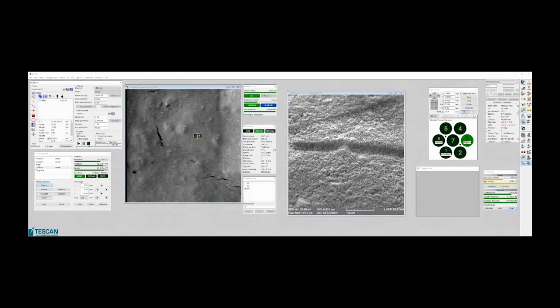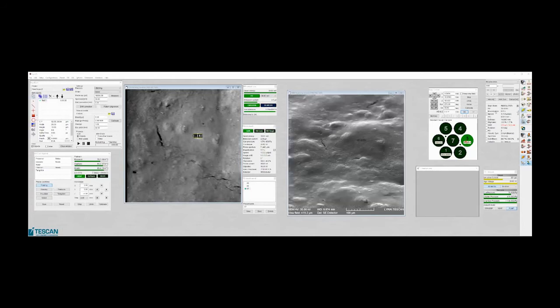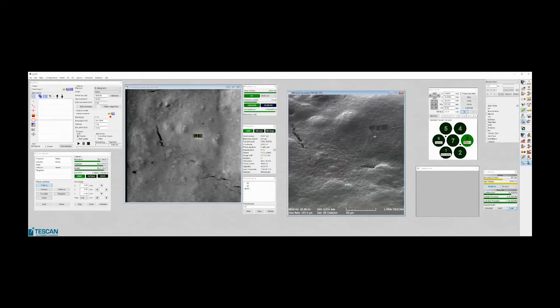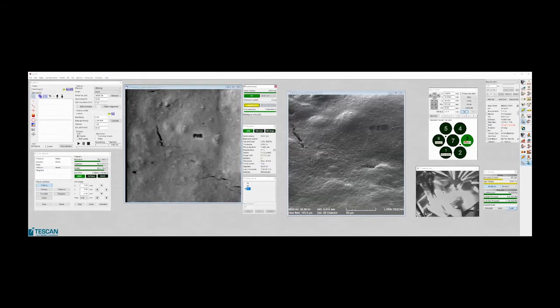Okay. Yeah, it's already there. Yep. See it in here. Okay, it's nothing very scientific, but you can create whatever you want, just as an example. So what is the typical reason why we are using it?